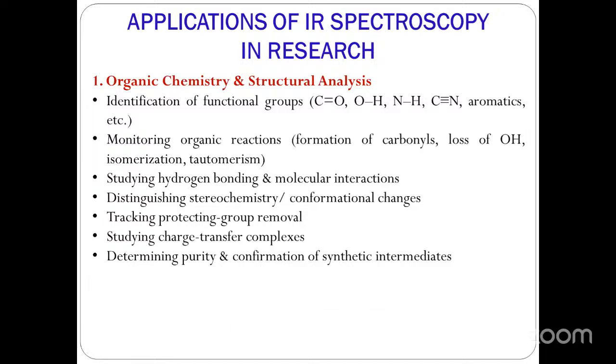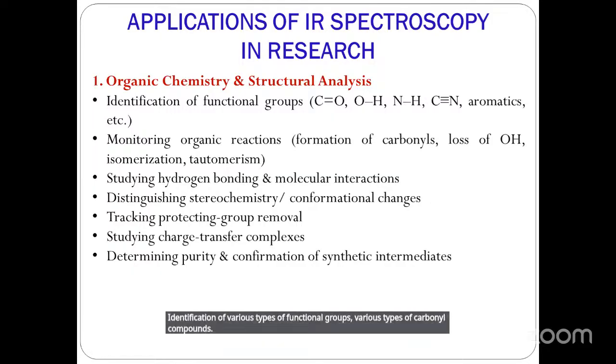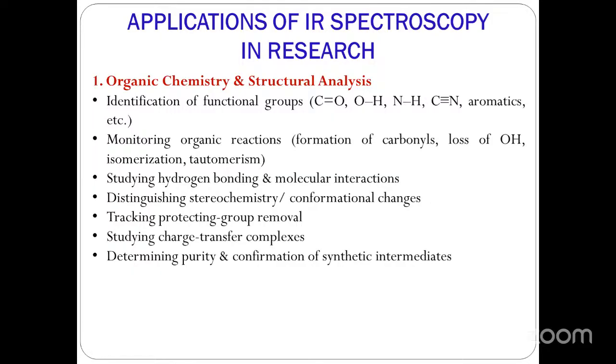Now, as far as applications of IR spectroscopy are concerned, in organic chemistry for structural analysis, it gives us an idea about identification of various types of functional groups, various types of carbonyl compounds, hydroxy compounds, compounds having NH, nitrile, aromatic, olefins, carbon heterobonds, all can be identified.